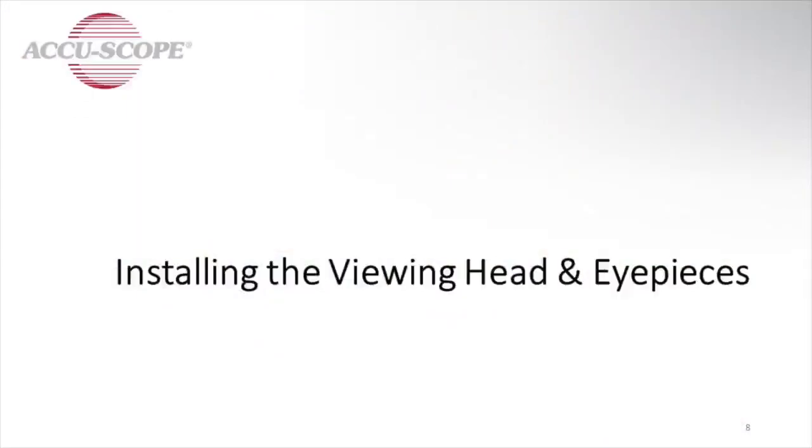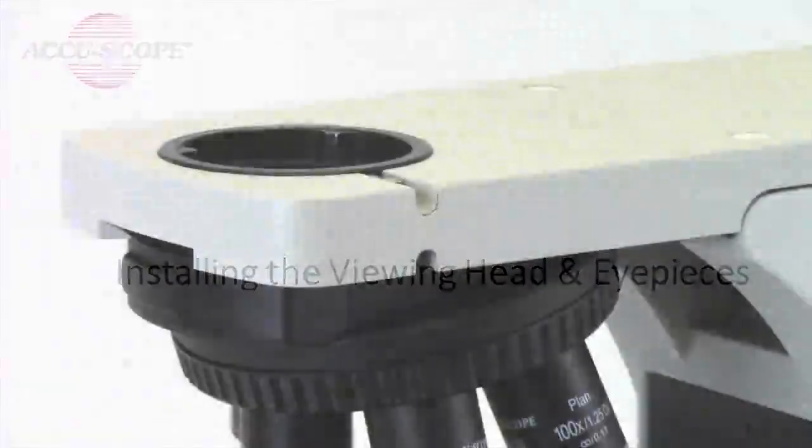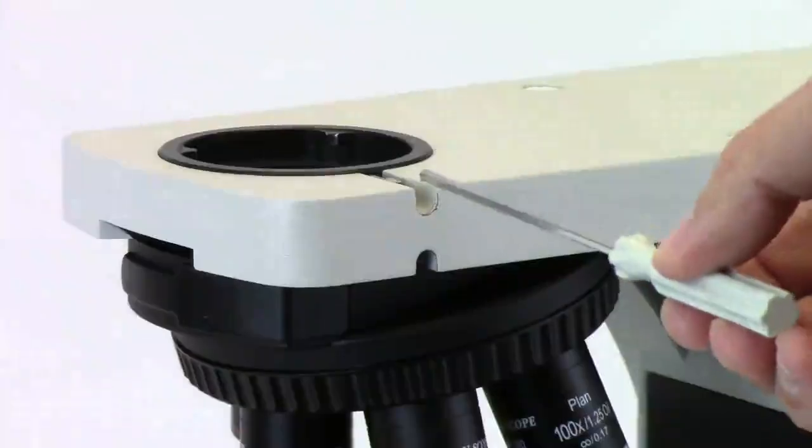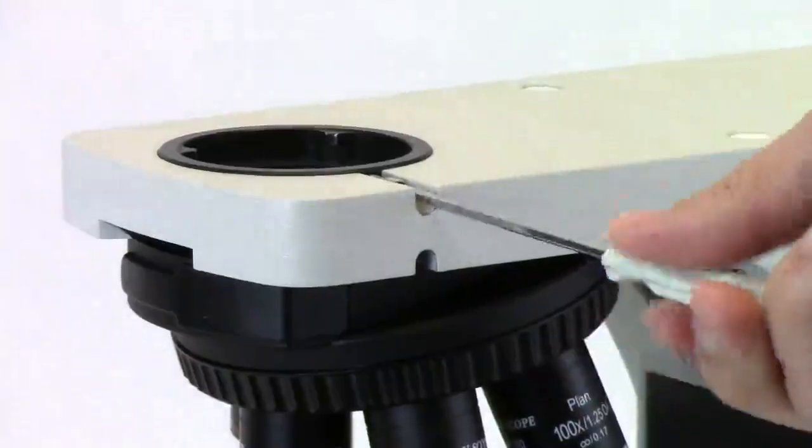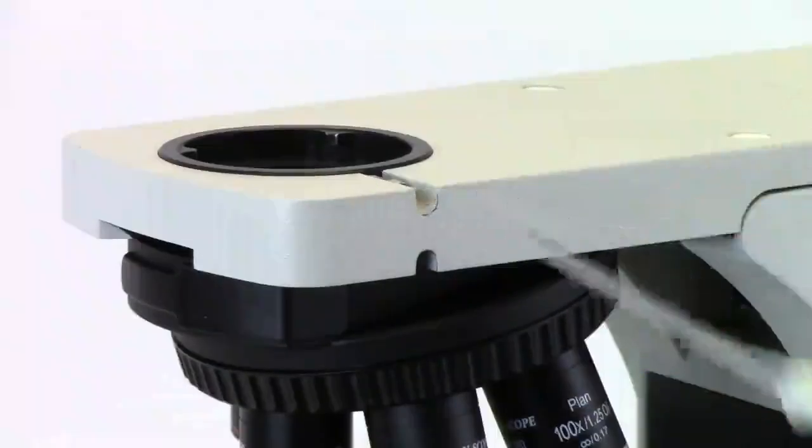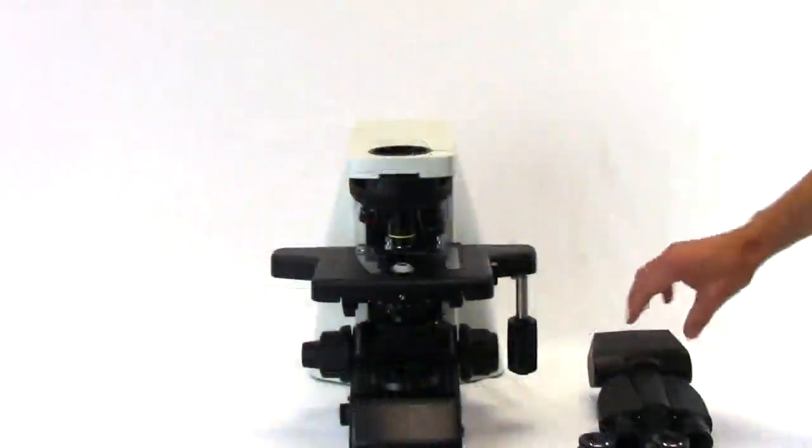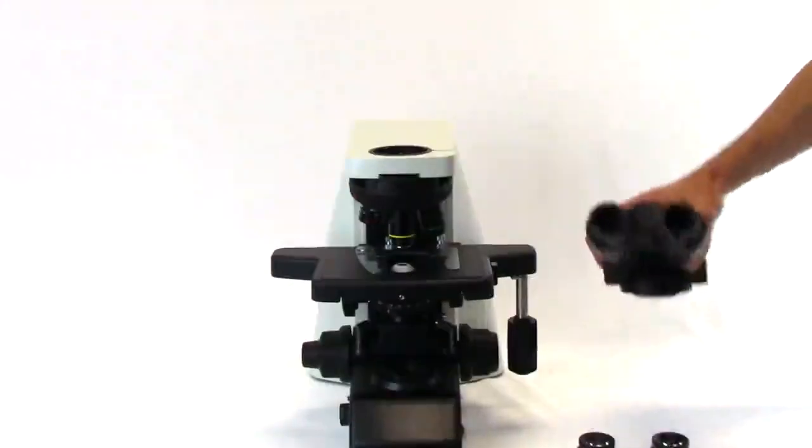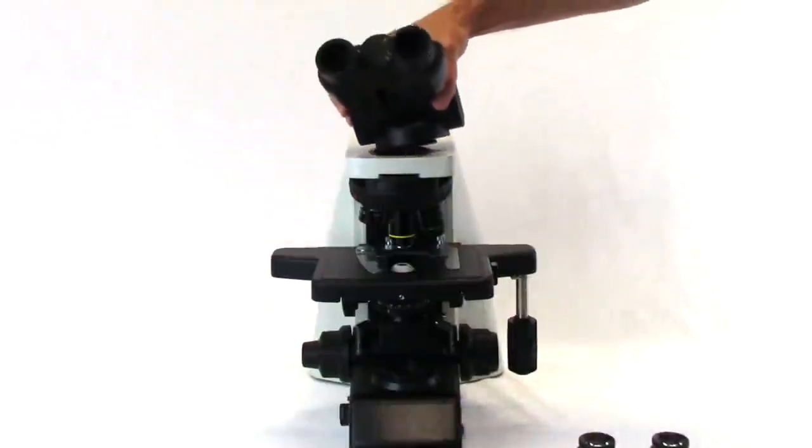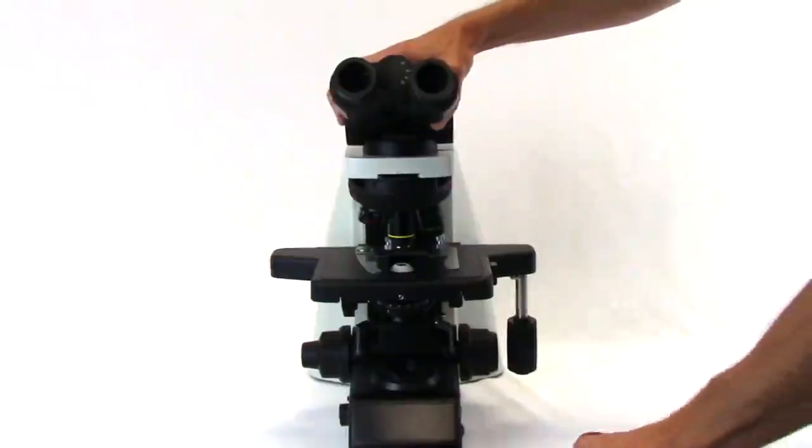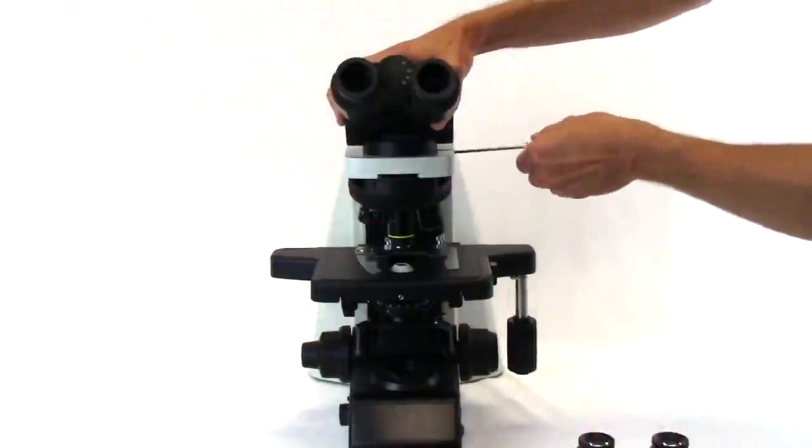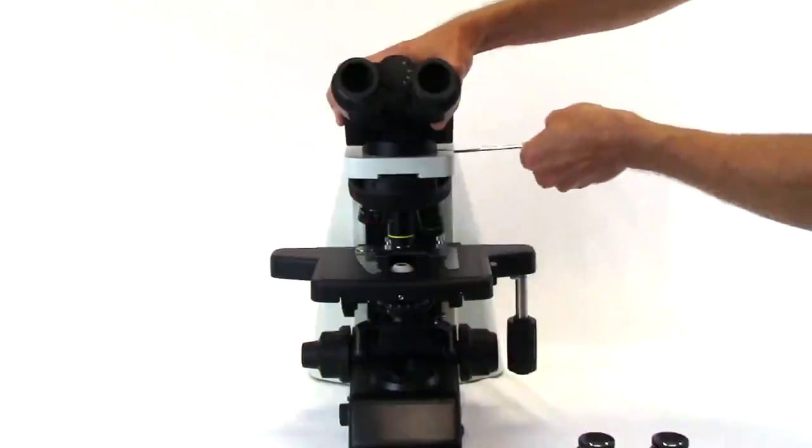Installing the viewing head and eyepieces. Using the hex wrench, loosen the lock screw on the top of the microscope body. Position the viewing head above the dovetail opening, tilted slightly to the left and with the two eyepiece tubes facing forward. Ensure the head sits flat on the microscope frame and retighten the lock screw.